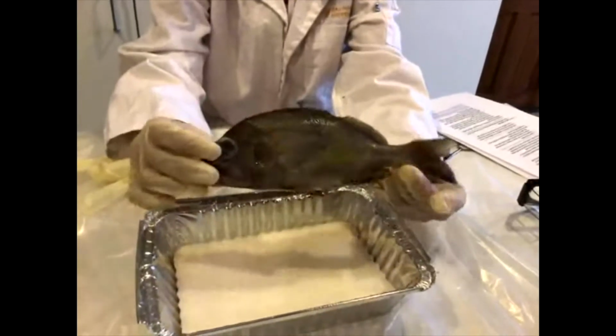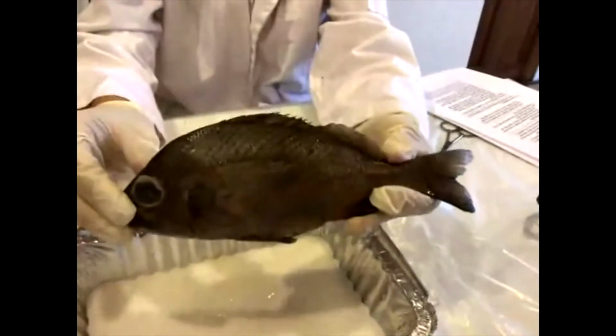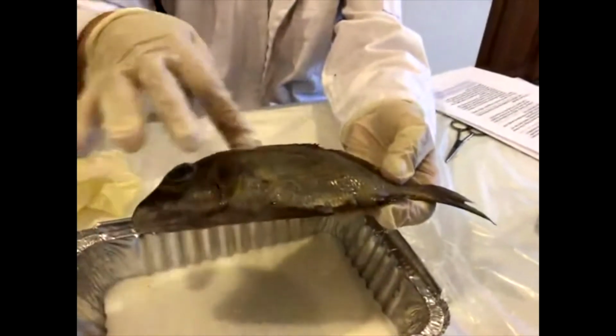So what we're going to do today is we're going to start with the external anatomy, so I'll show you some of this, and then we're going to kind of cut a window into our fish in a square.